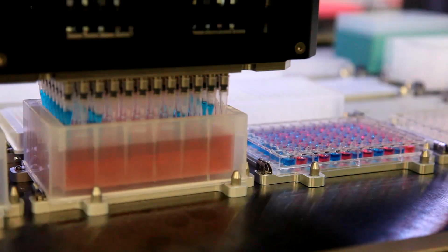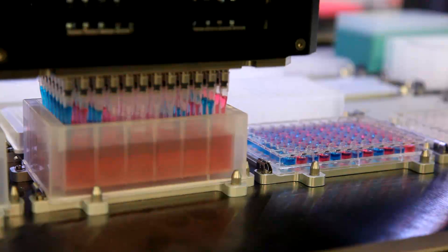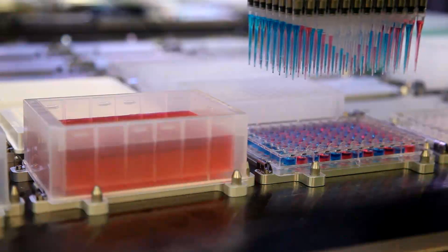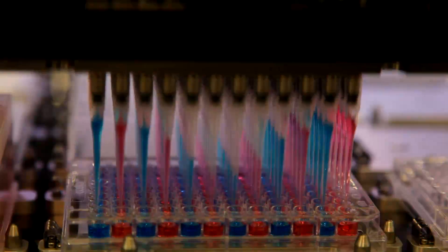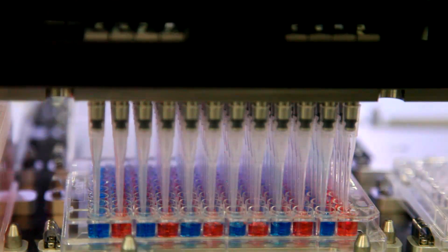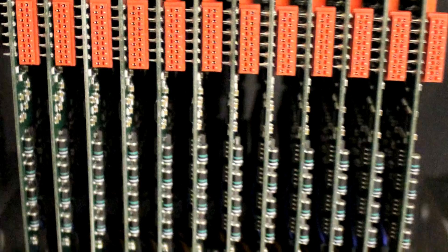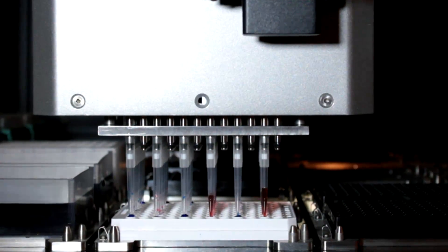The 96 VVP head does away with the use of syringes to transfer liquid. It's a pressure and vacuum based system with 96 individual flow sensors and 96 solenoid valves. The system actually monitors every single tip and the volume entering the tip according to its own physical properties and viscosity.